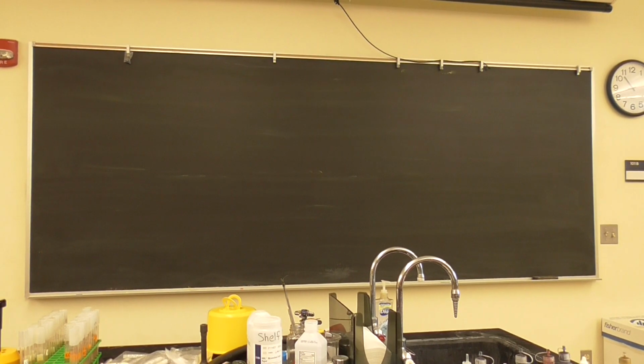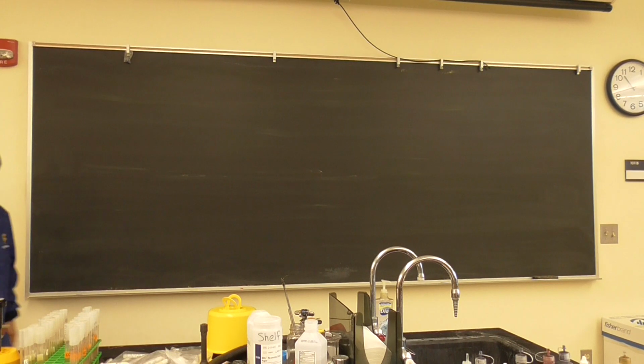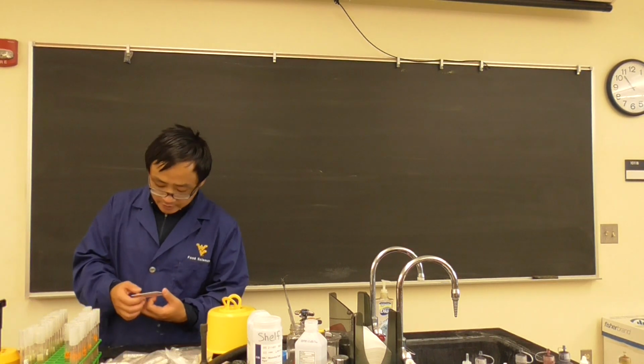Okay, let's have a class. First of all, we want to go over some of the results from last week.